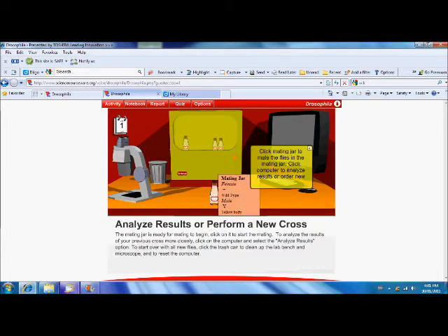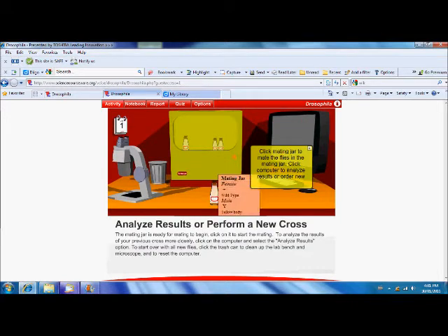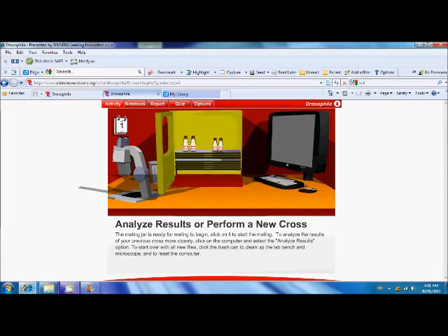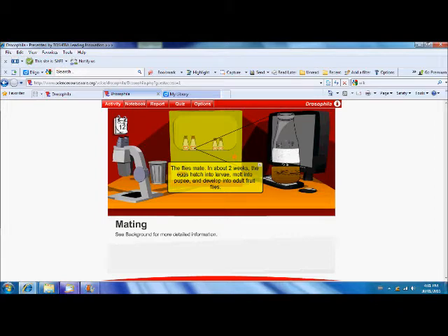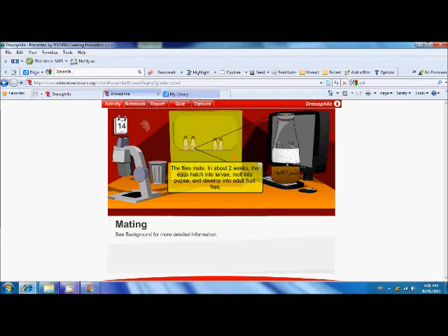Okay, now we've got our first offsprings. The wild female and the yellow male. So, we're going to cross those. So, let's click on that. And once again, we have to wait. You'll see our incubator jar. Things are changing in there.